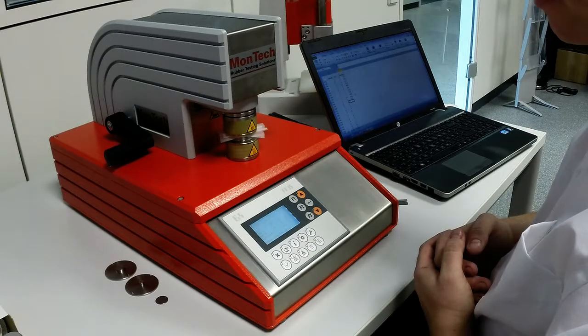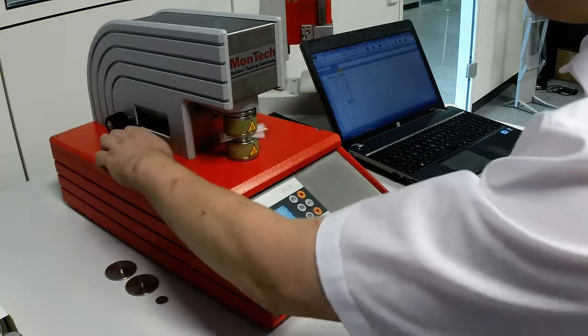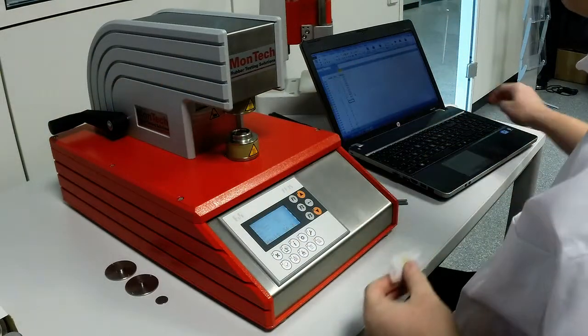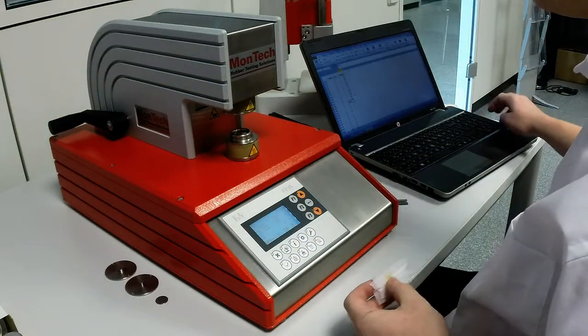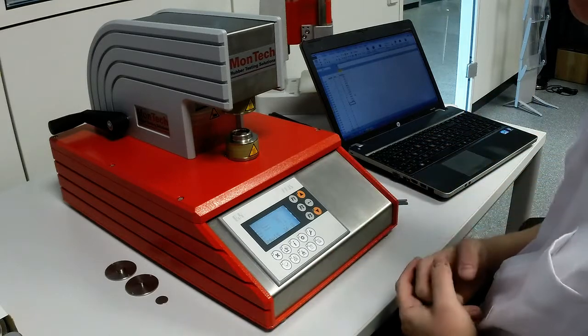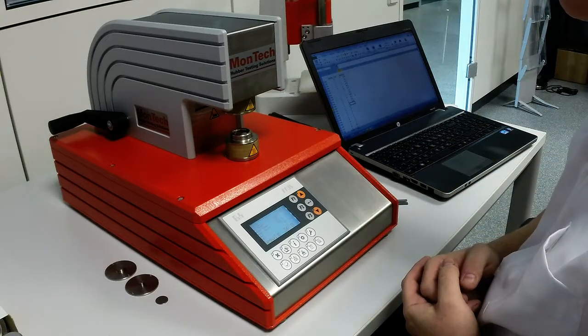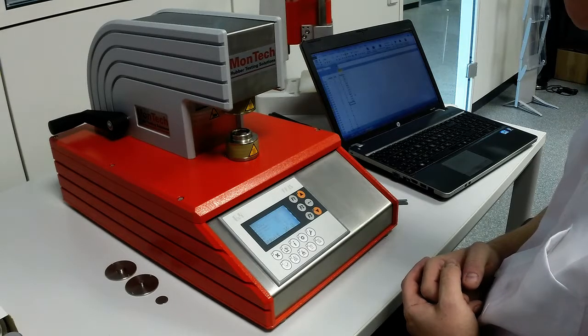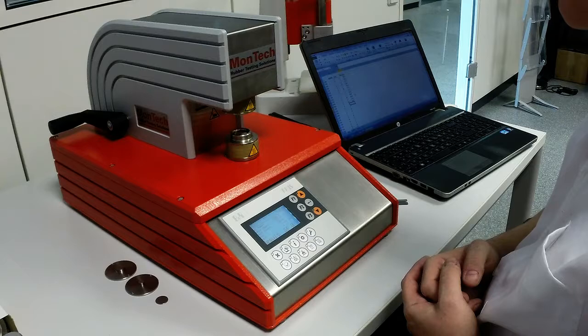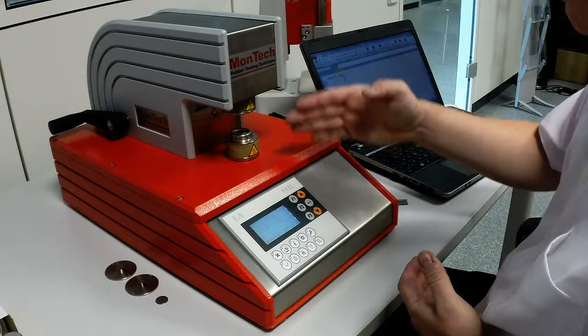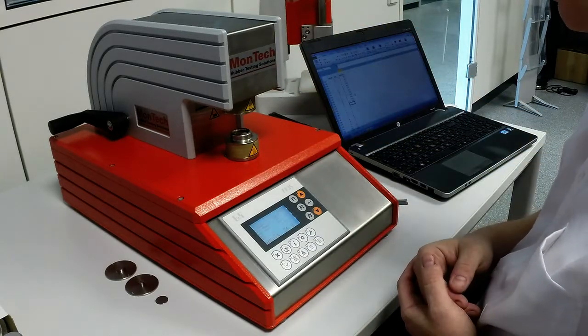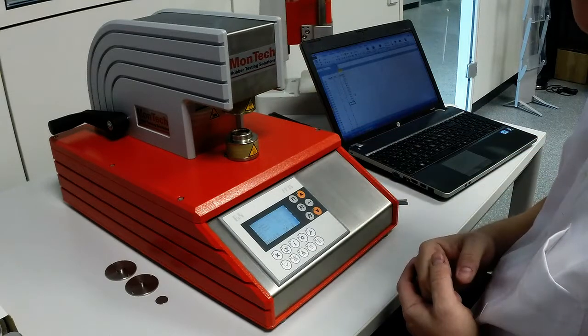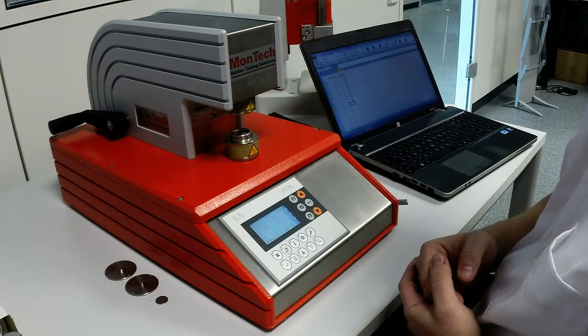Final test completed: 36.8. As you can see, the RP3000 is the most accurate and precise rapid plastimeter in the market, with a typical standard deviation less than one plasticity unit. This can be realized due to the temperature compensated precise mechanical system, with a resolution of less than one micron.